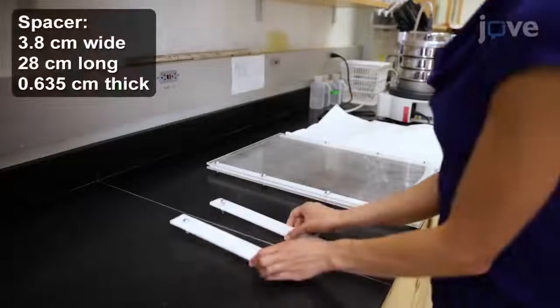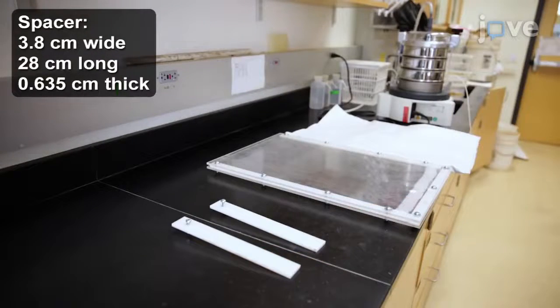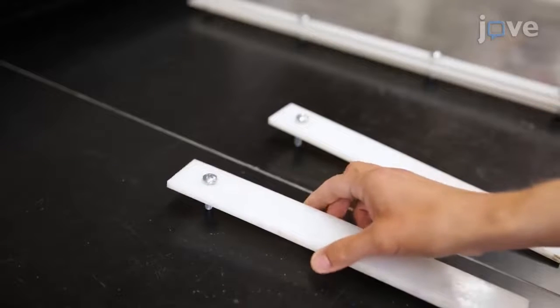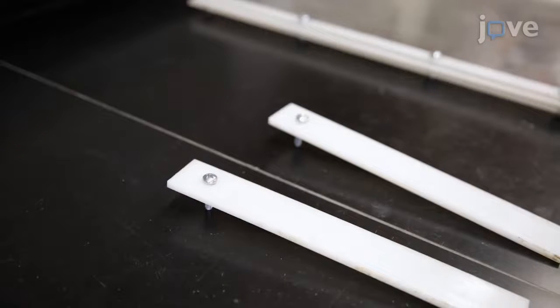Also create two spacers to form the treatment and control patches. Make them with high density polyethylene sheets and secure a screw at the top to allow only partial insertion.